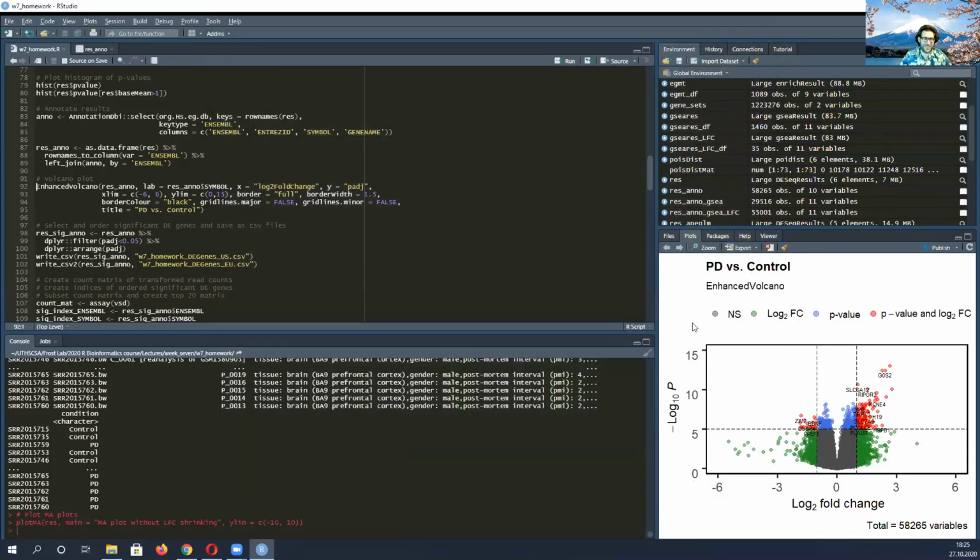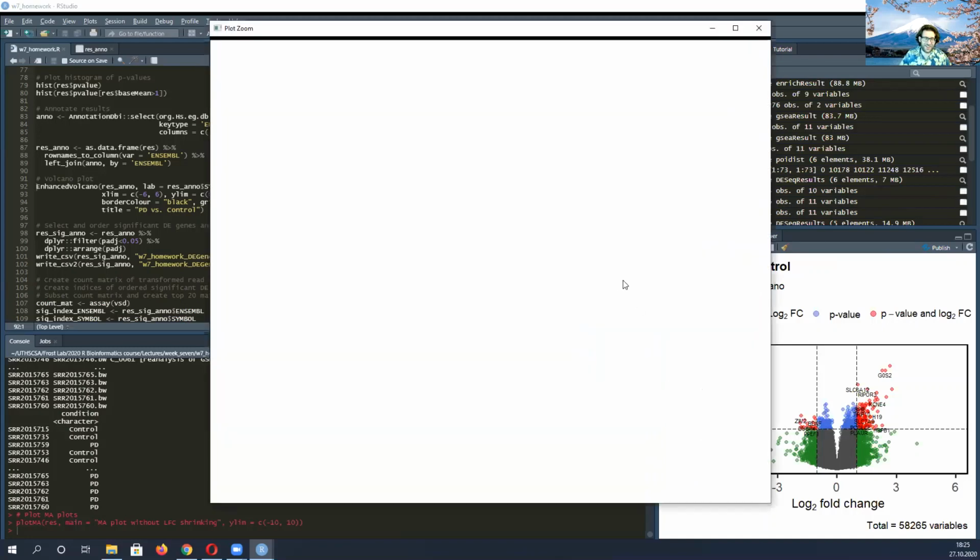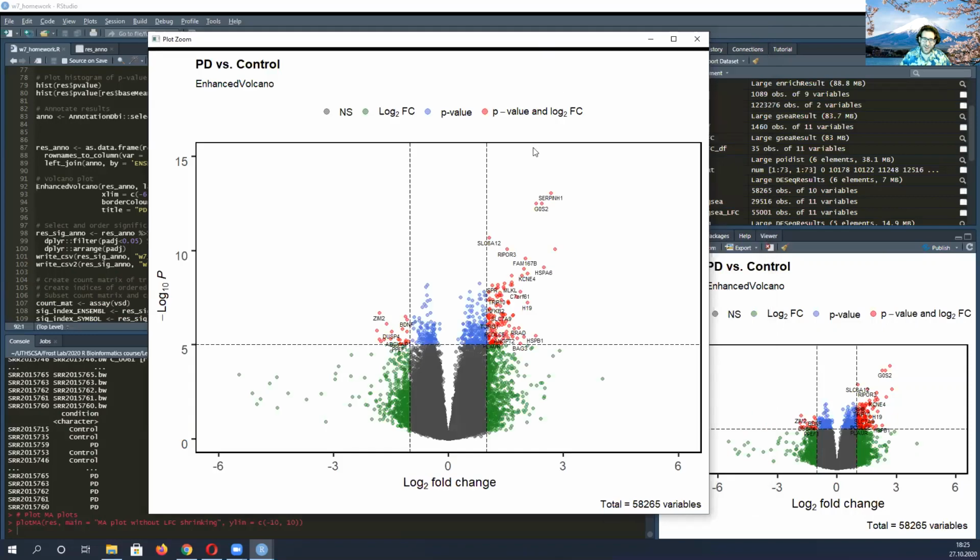Even when you go to publish it, it's also probably okay if you don't have perfectly rationalized cutoffs either. Yeah, I mean, I really don't. This is, what, a 10 to the minus 5 adjusted p-value. All right, yeah, that sounds about right. I don't know. So there was nothing there where I was cutting across any populations that looked weird, so I just left it alone.